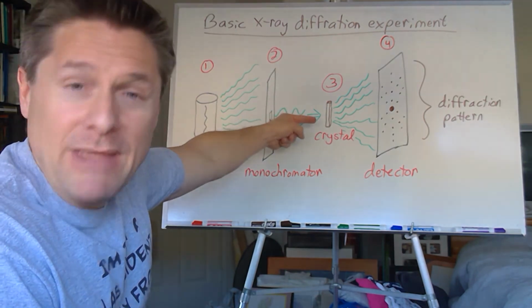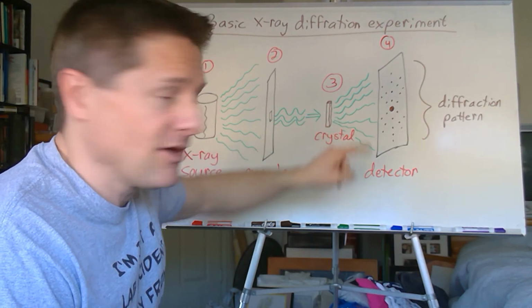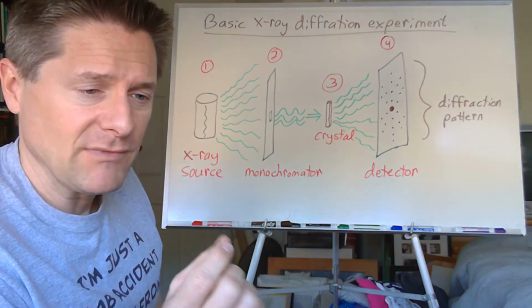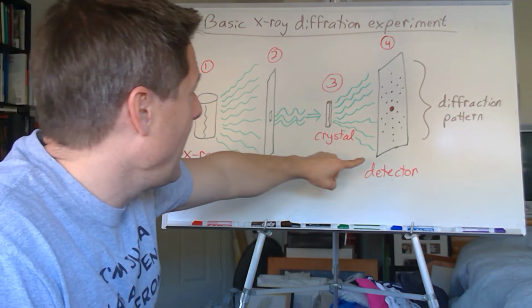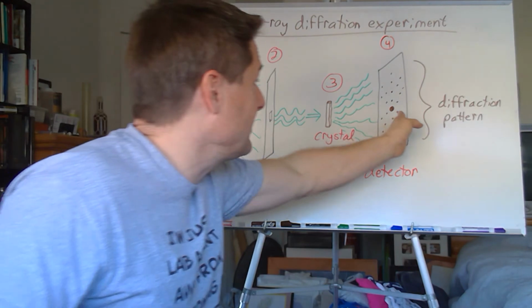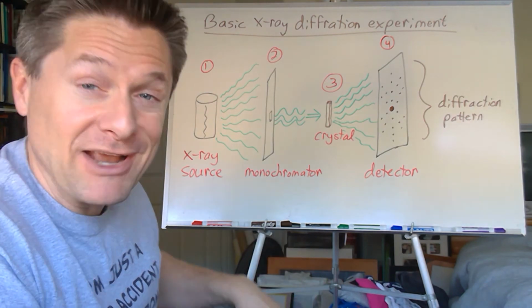We've got to collimate the beam, get all the wavelengths the same, collimate it so we can strike the crystal source. So we've got some thin crystal that can be mounted on a rotatable tray or something. The one I saw, they rotated the detector around the crystal. They could rotate it all the way around the crystal if they wanted to, and had nice shielding so you didn't get blasted by your own X-rays and whatnot.